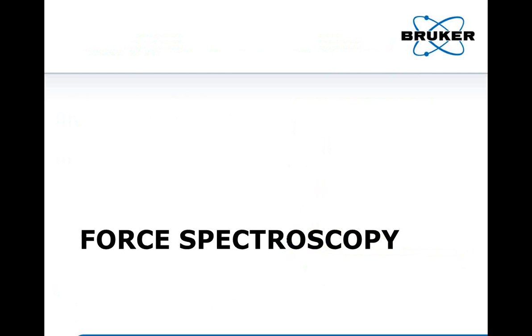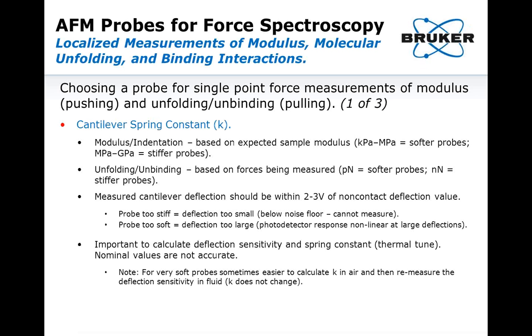So next we're going to investigate probes used for force spectroscopy, and for the most part we're going to be discussing force spectroscopy in the context of biological applications. AFM force spectroscopy is the localized measurement of modulus in molecular unfolding and binding interactions.